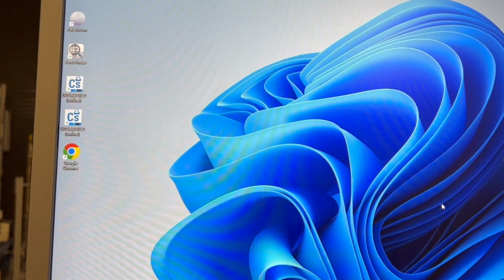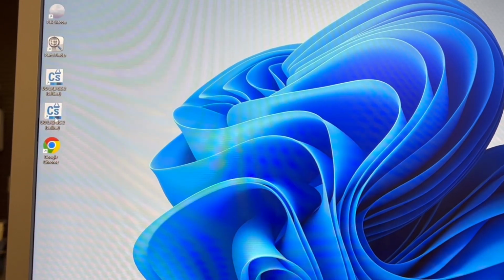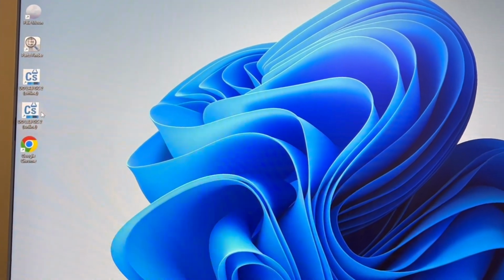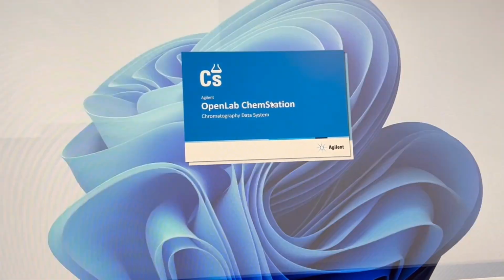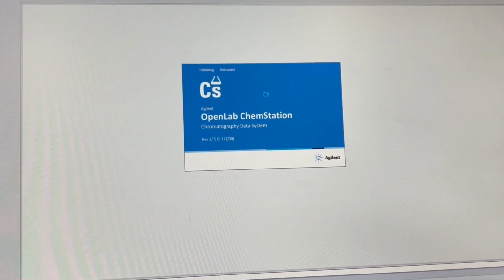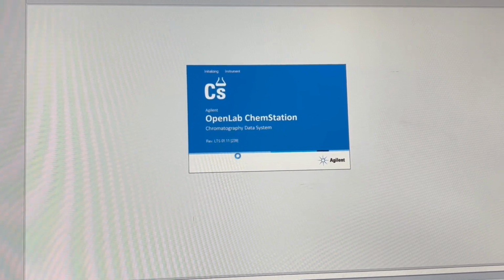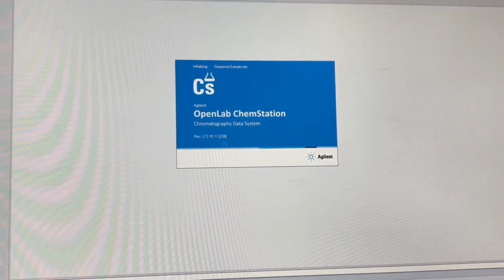To access the chromatograph software, you are going to go to UOLab GC2 online. And with this system, you'll be able to see the peaks of the different compounds flowing through the GC unit.